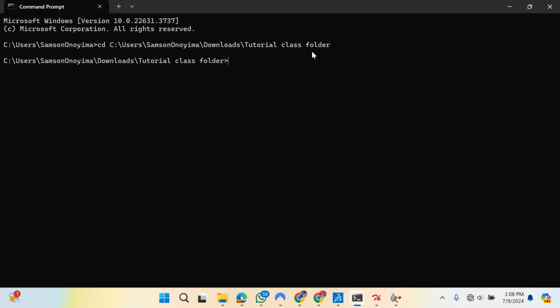Is that alright? So at this point, I want to now call in my tools. I'm calling the software that is going to do the docking, which is the Autodock Vina.exe. That is the Autodock Vina software that's going to perform the docking. I'll do that by typing backslash p. Backslash p is to find the path, the path where the software was located.